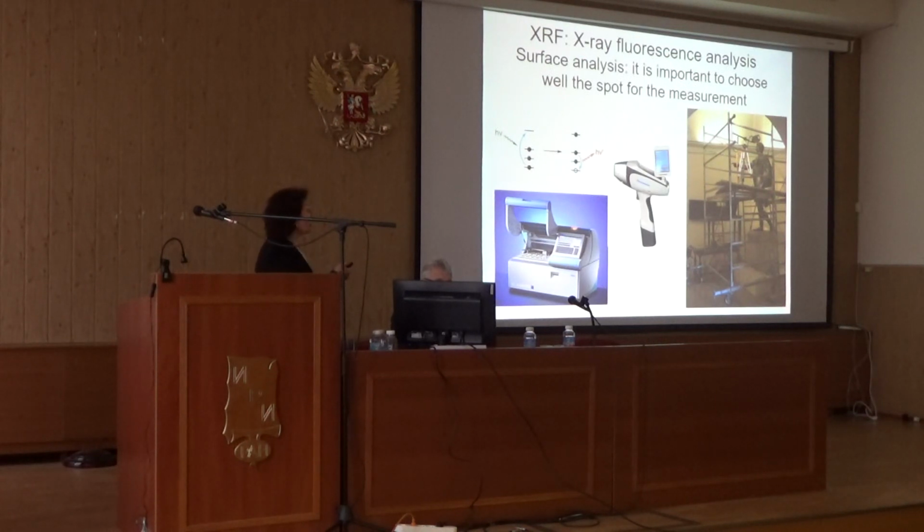I am using normally this kind of equipment here, which consists of a transformer here, a stabilizer, a computer. They are on a table here, and this is the head of the system, which can be moved as necessary.